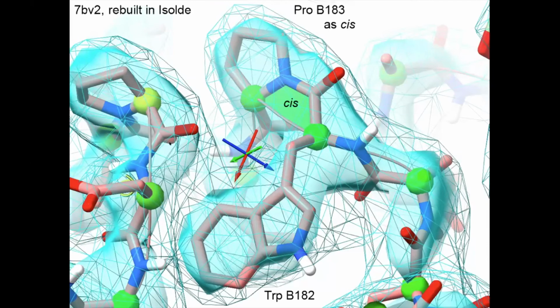So here's another example, this is from the remdesivir polymerase structure in the SARS proteins. And again, just an example of RNA that's very correctable. So it has outlier conformations for one region in what is overall an A-form helix.